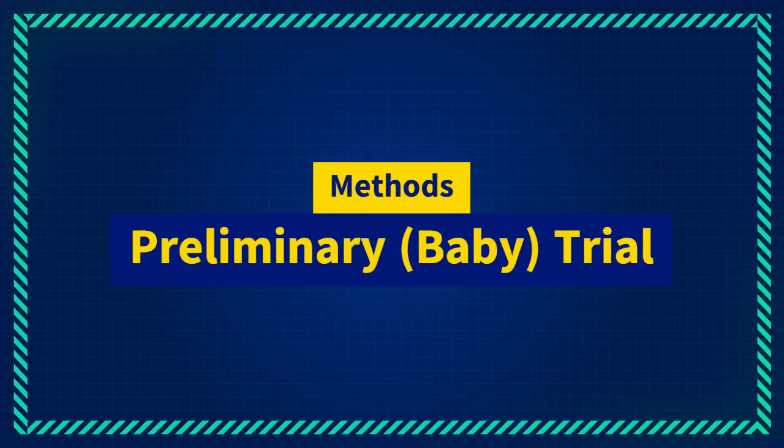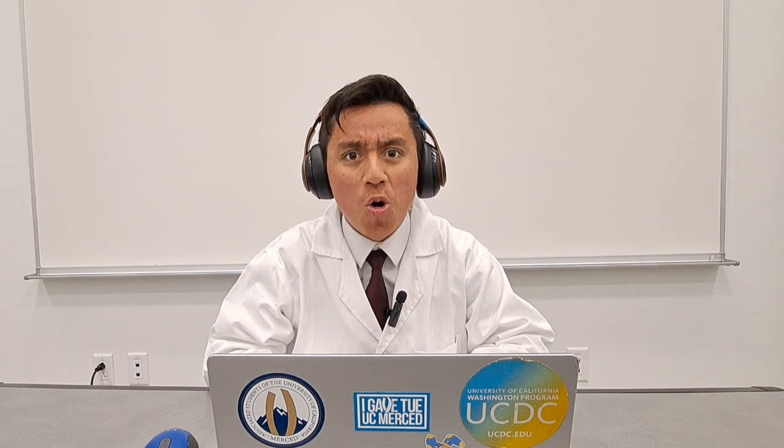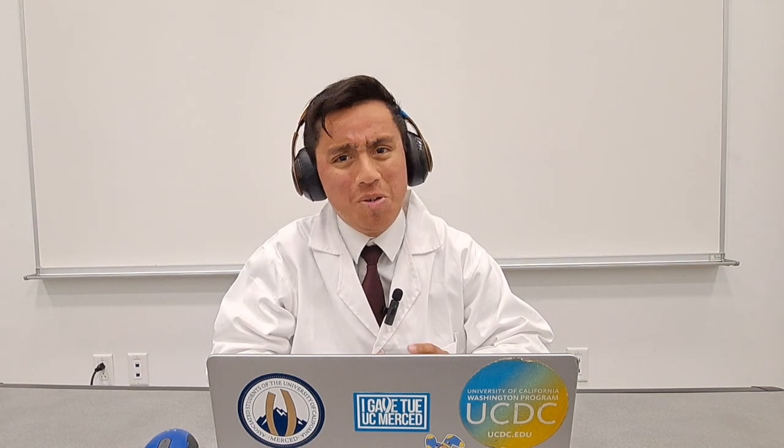Pay attention. It all started on April 19th, where my group took all the materials in a bucket and went down to Little Lake to see the moment of truth. By then, we had already calibrated all of our pH and DO meters with the proper buffer solutions. However, throughout the process of collecting our data, we ended up calibrating our meters with DI water. What? Which turned out to be something we were not supposed to do, but we ended up getting the data we got anyway, according to this table.